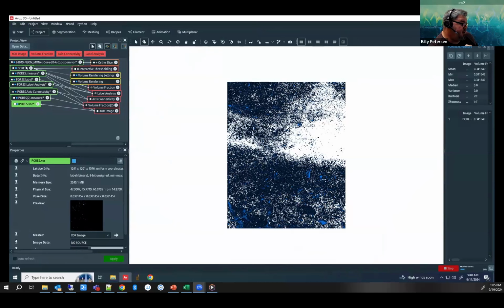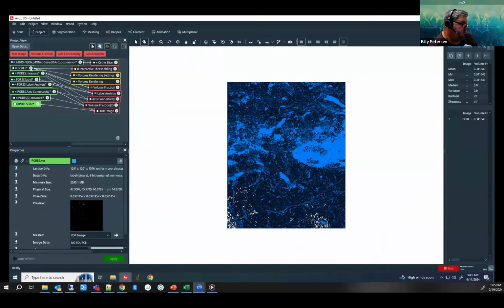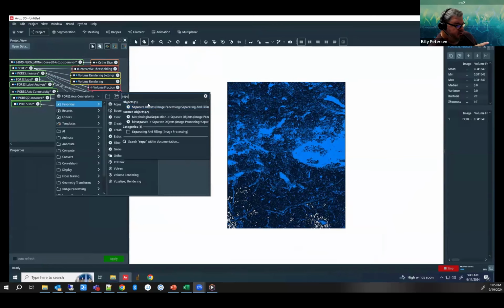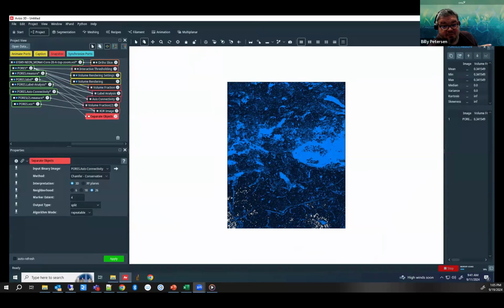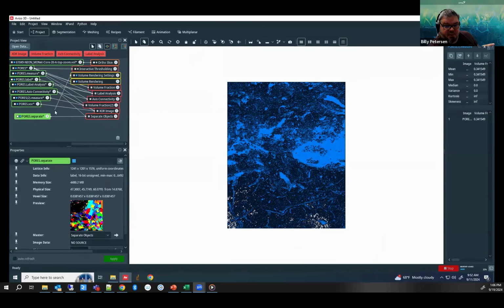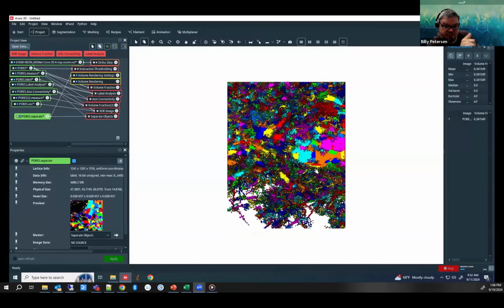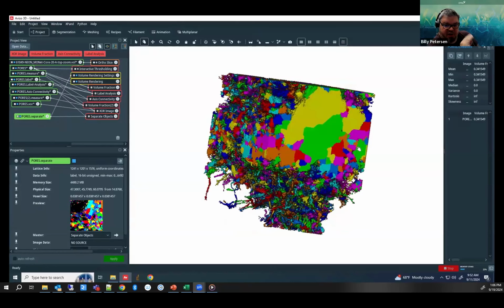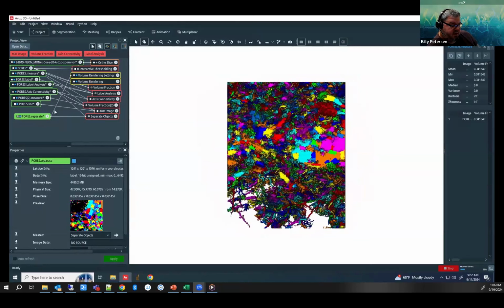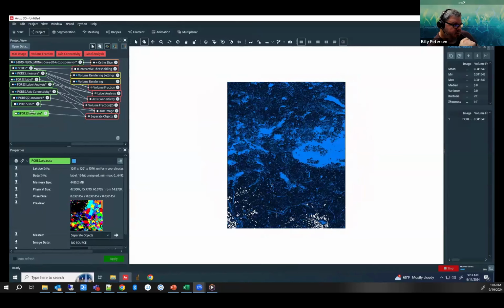And then from here, okay, so this part right here, separate objects, takes 30 minutes to load. You get it in 3 seconds. You're welcome. So we're checking connected objects by axes, and we're having it classify them as individual pores itself. Now this is really cool. Then, Sharon, this is what I had to go in and redo right here, and then do the label analysis for yours. I learned something from this, so once again, thank you. And we get this, individual classified connected pores.